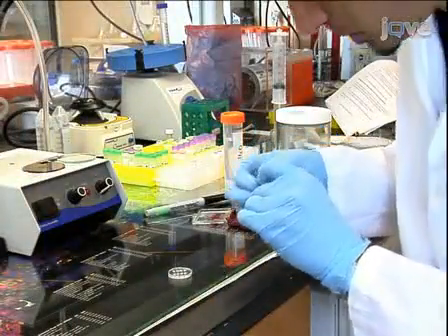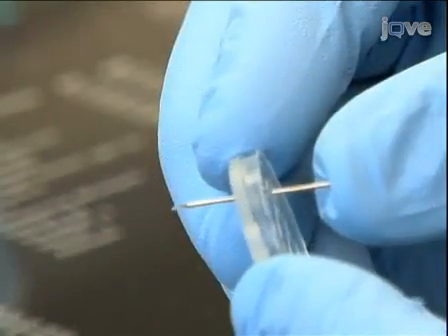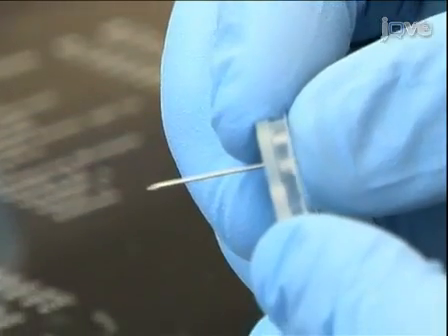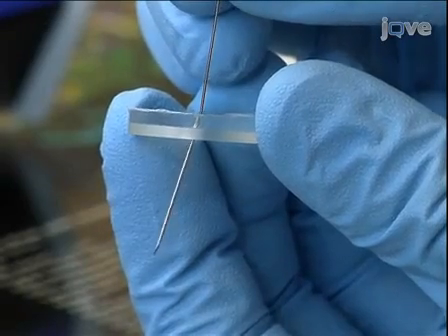To do this, first insert a needle, and then insert the capillary tubing until it reaches the channel.